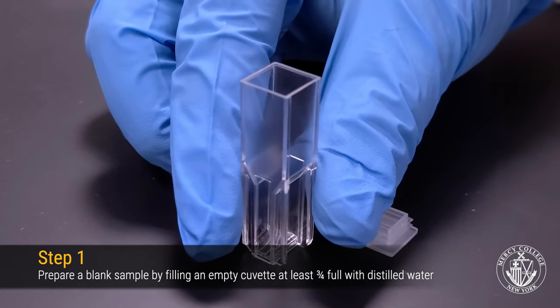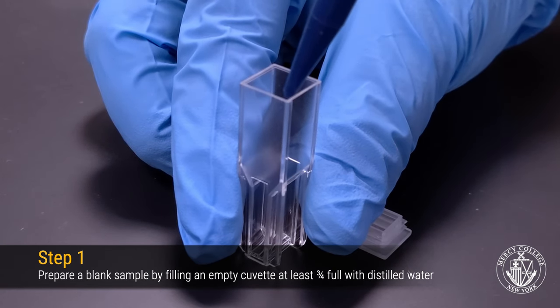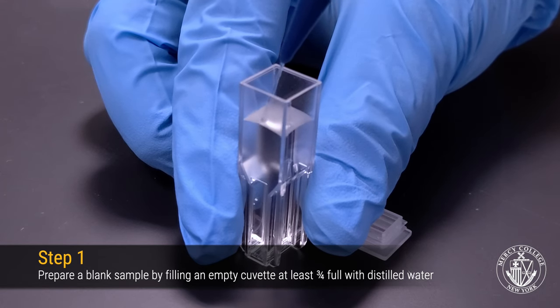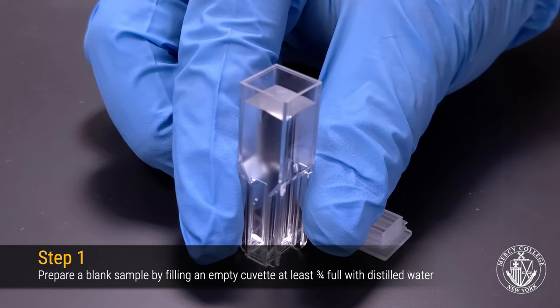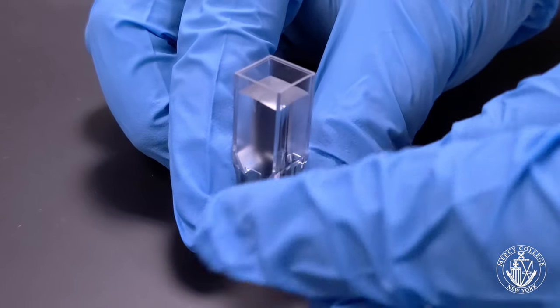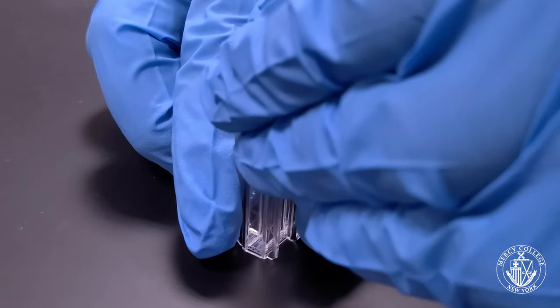First, we'll take an empty polystyrene cuvette and fill it at least three-quarters full with distilled water. This will function as a blank or reference sample in our experiment. If you have a cuvette cap available, go ahead and cap the cuvette to avoid spilling it during the experiment.